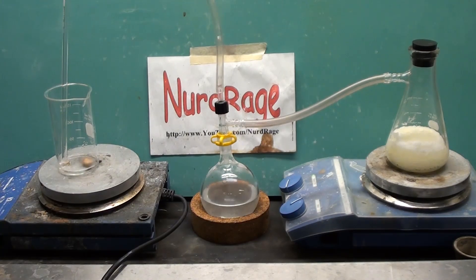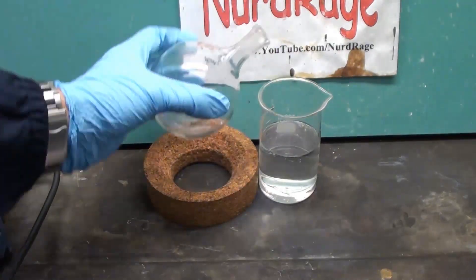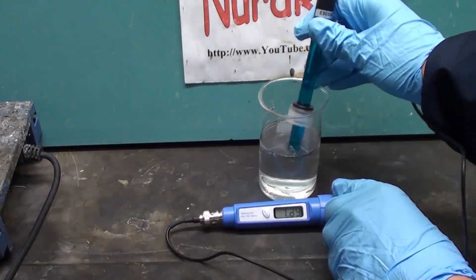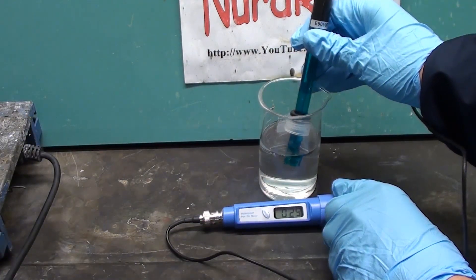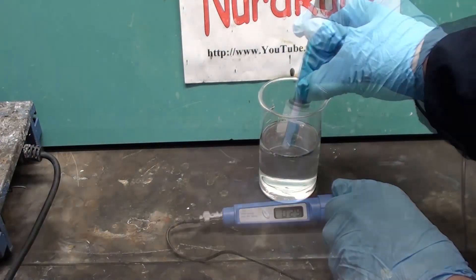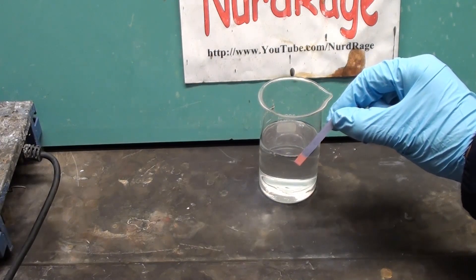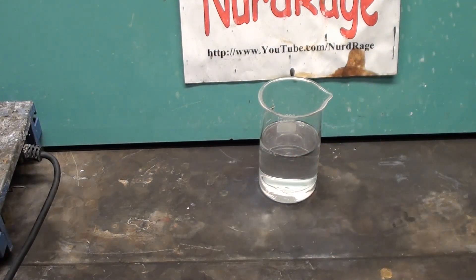And there you go. Luckily it's all contained in the round bottom flask so I can still collect it. As you can see with my pH meter, the pH is very low indicating high acidity. It also turns blue pH paper red. The exact concentration can be determined by titration or set using azeotropic distillation.